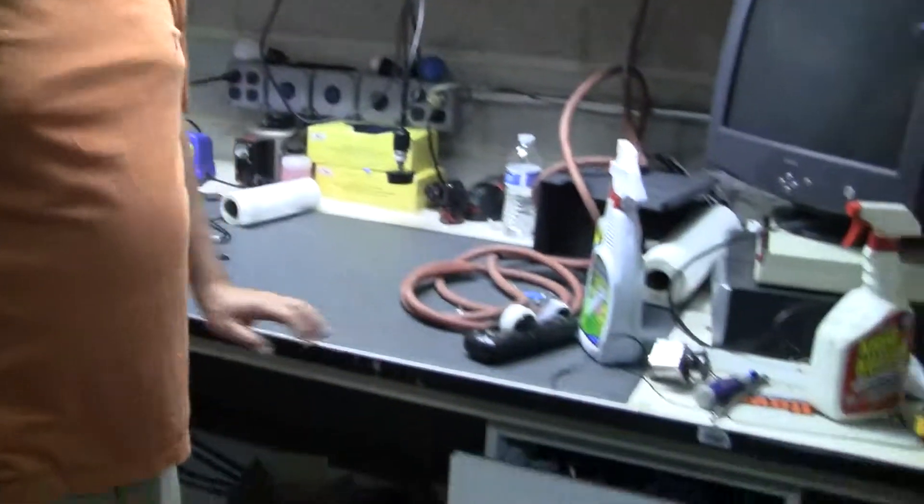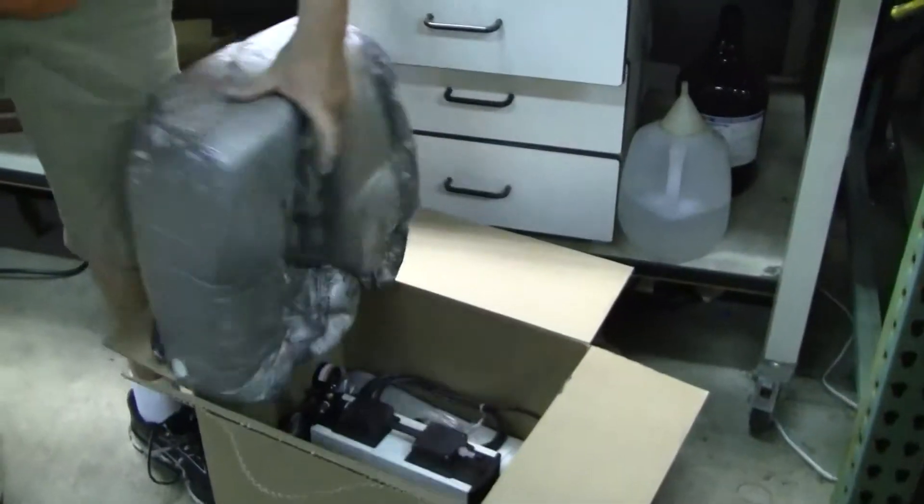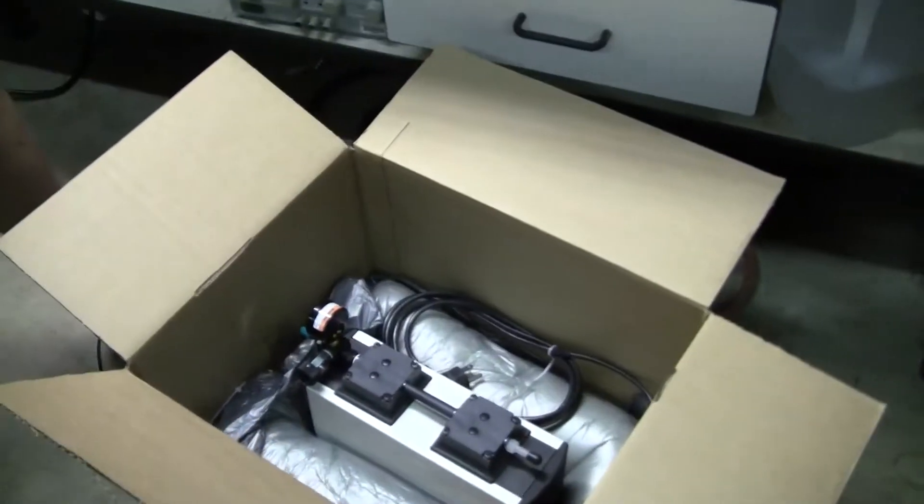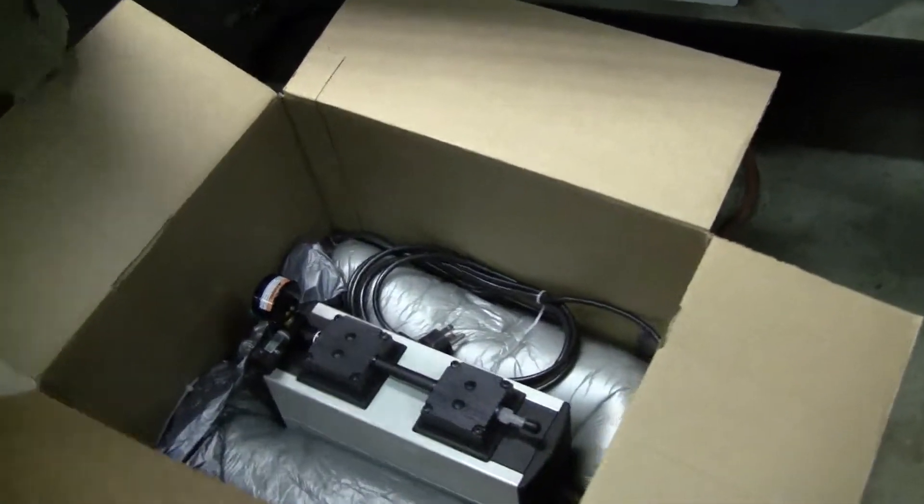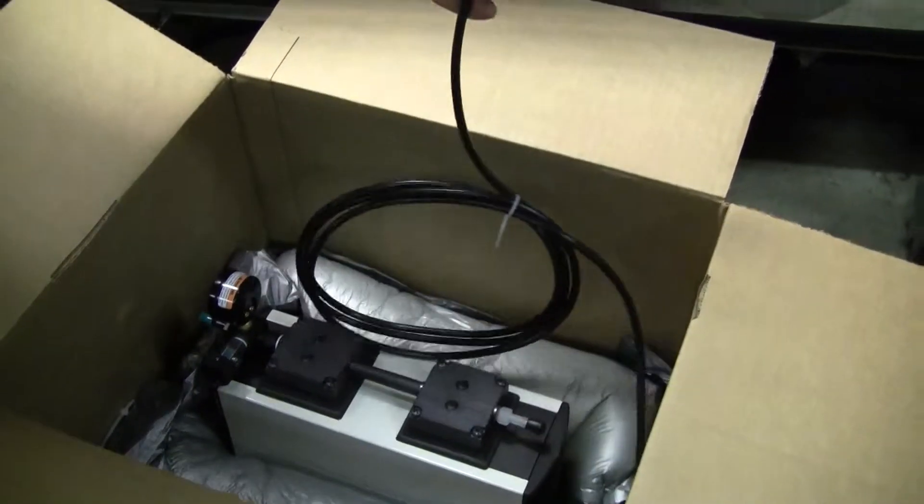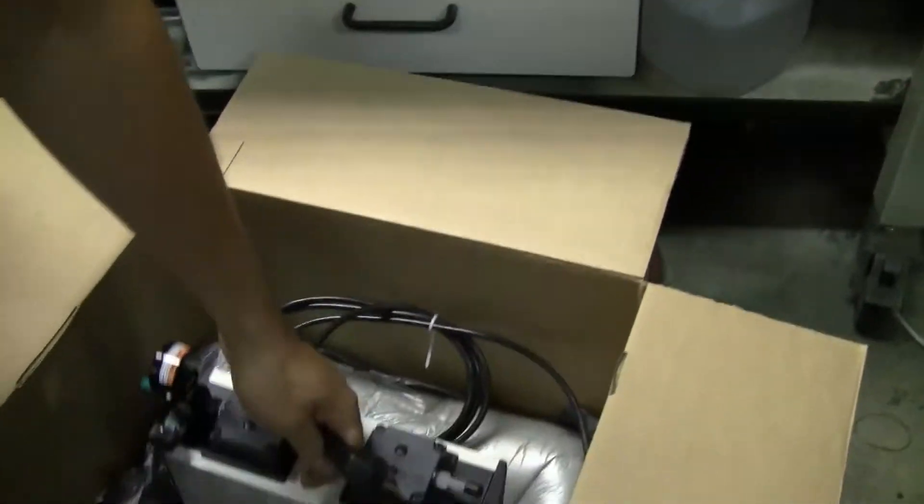Sometimes in the used equipment business, it is very nice to have a find, as they call it, of a brand new item. And today, what we discovered, very nice, in the box, a KMF pump. Judging by the plug, it has never been used.